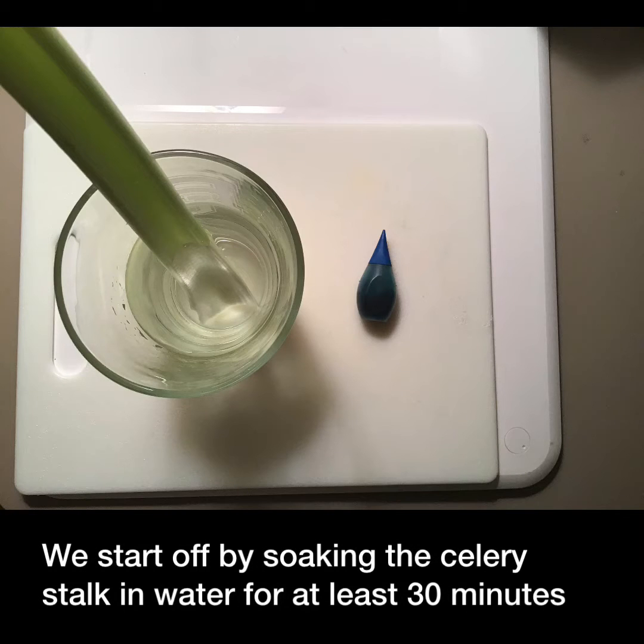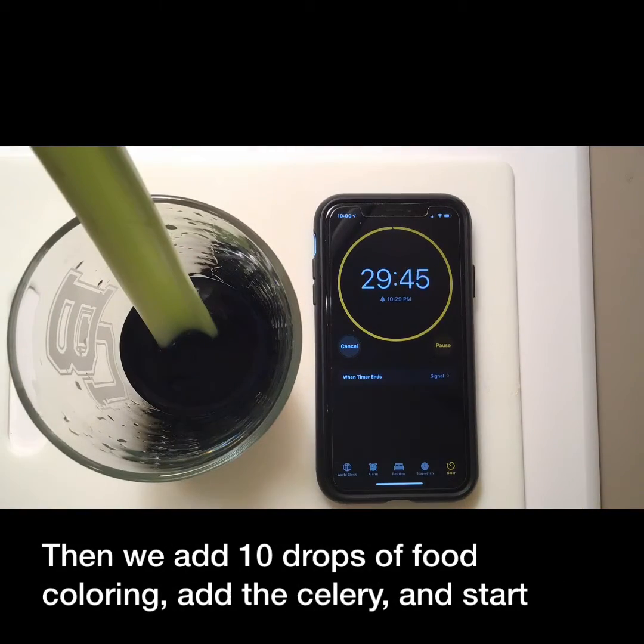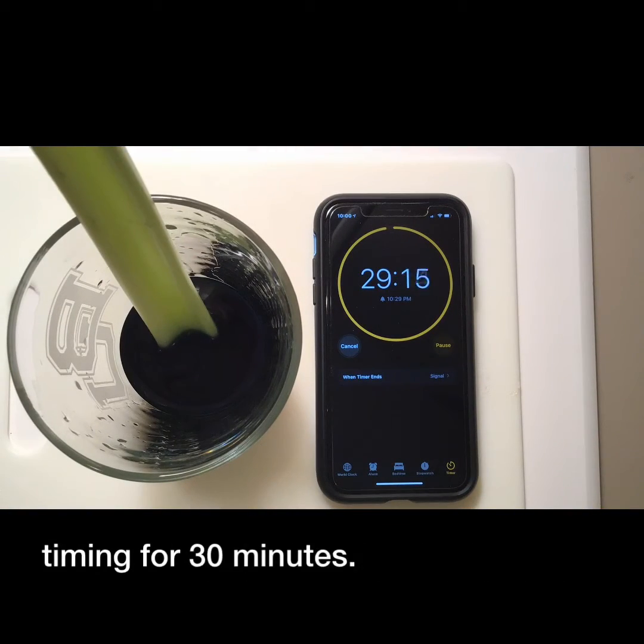We start off by soaking the celery stalk in water for at least 30 minutes. Then we add 10 drops of food coloring, add the celery, and start timing for 30 minutes.